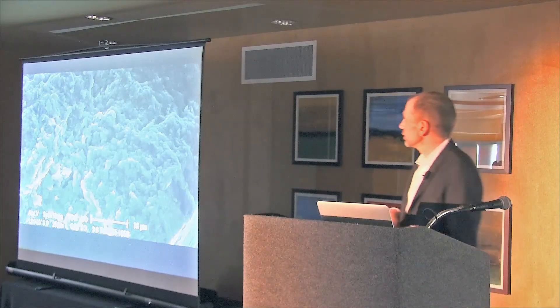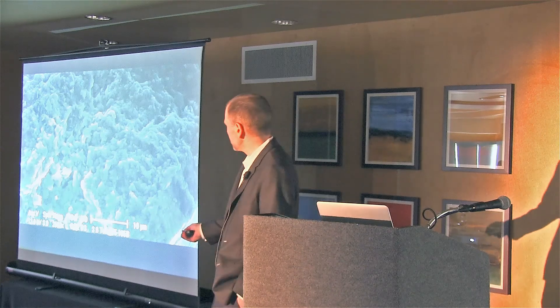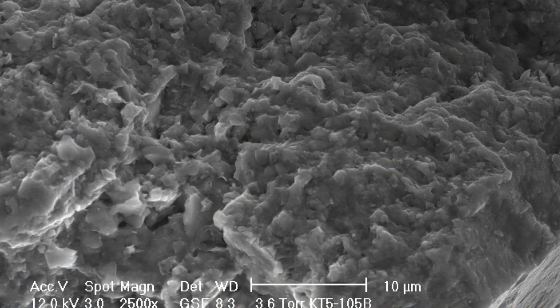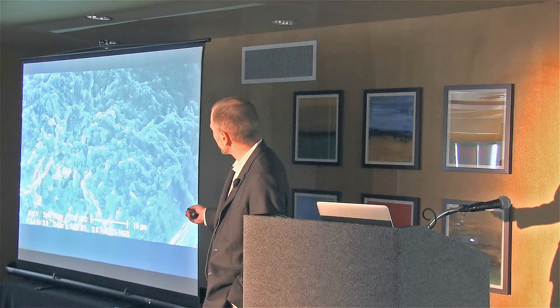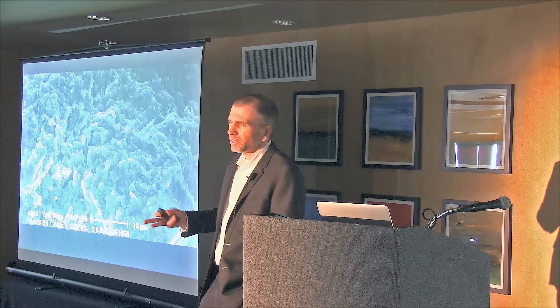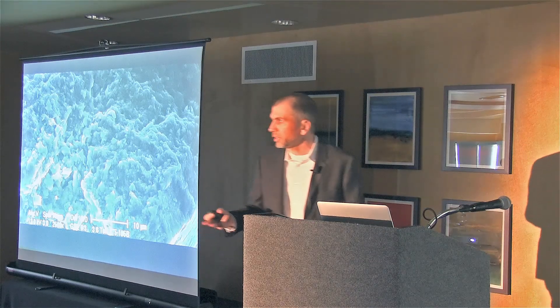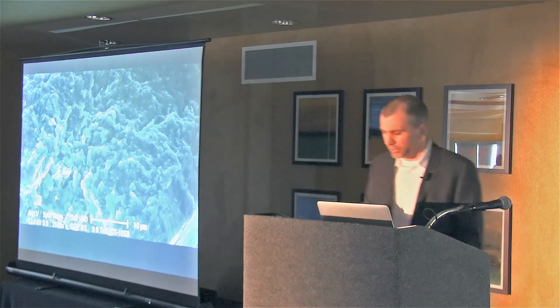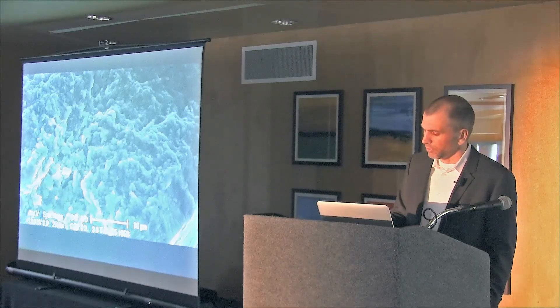This next image has a 10-micron bar at the bottom. The texture in this picture is actually these colloidal particles and the network on the surface, with that texture that allows the surface to become a home to bind contaminants, support microbes, and generate the synergy that provides contaminant degradation. You can see that the particles are indeed in approximately the one to two micron particle size range, which is what we expect based on the particle size distribution data from the development.